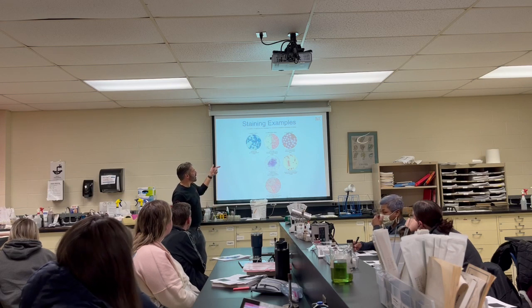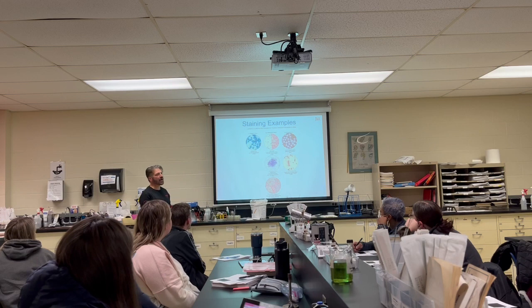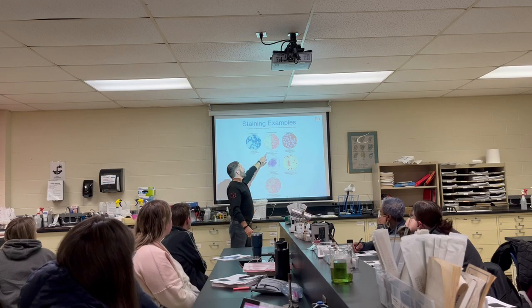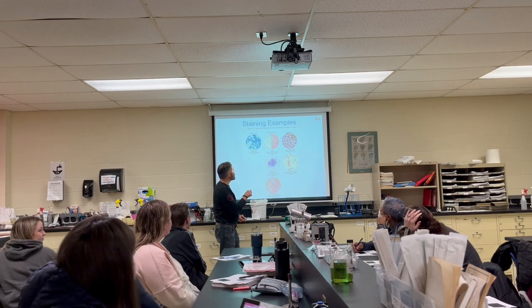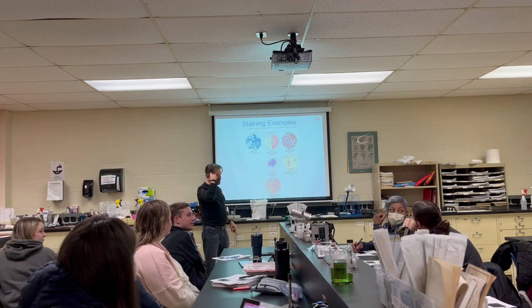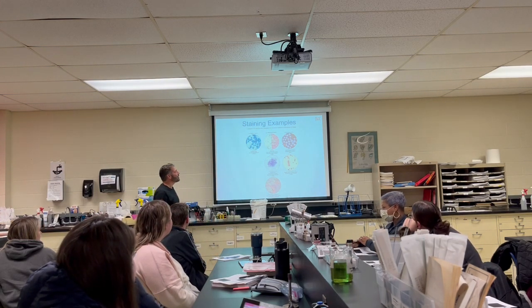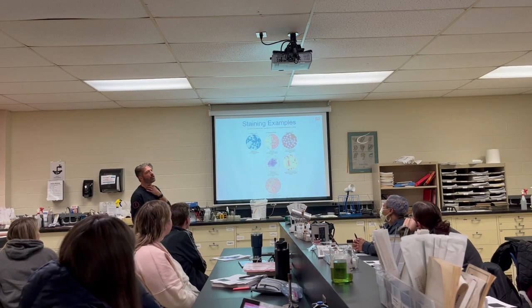Maybe. All right, so on this slide here, can you all agree that on the left half it's purple? Bluish purple? I can't see that far away. Do you need an eye exam? I can help you out, I can correct it. Sure. So those are gram positive. So we can all agree that that is purple.